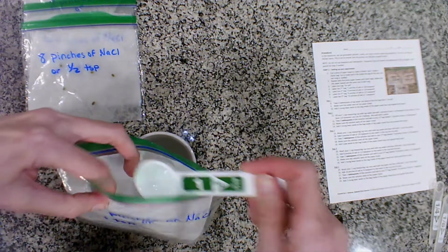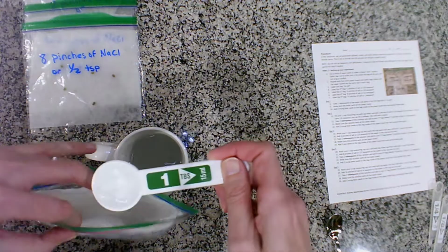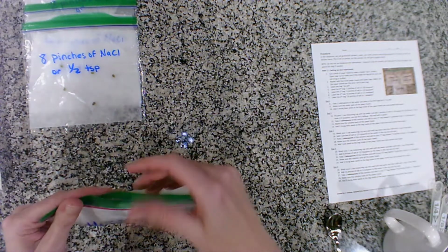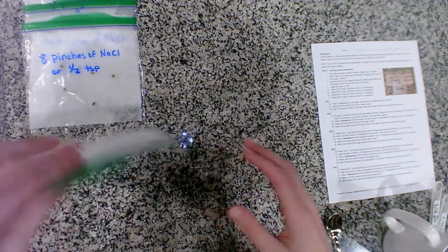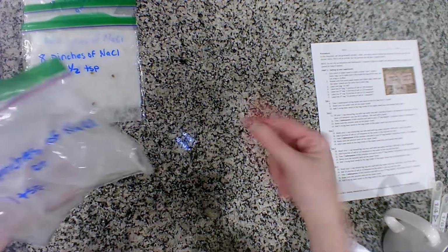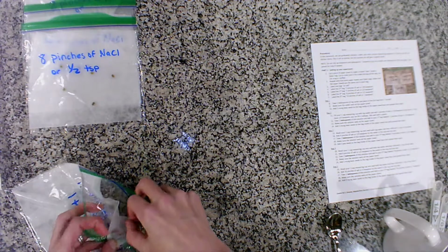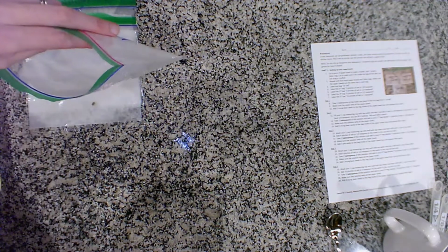Okay, I'm going to go ahead and get 2 tablespoons. I'm just kind of propping it with 1 finger. Put that to the side. All right, let's go ahead and get this paper towel soaked all the way through. Just salt all over. All right. Oops, you know what I just did? I lost my hold. All right.